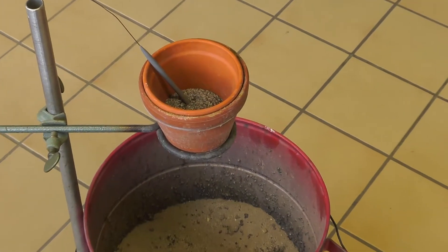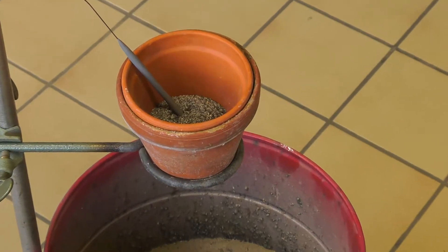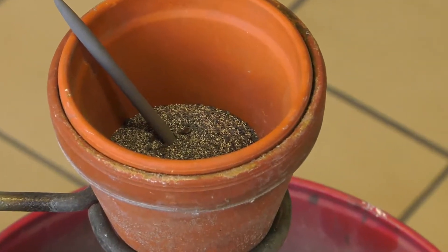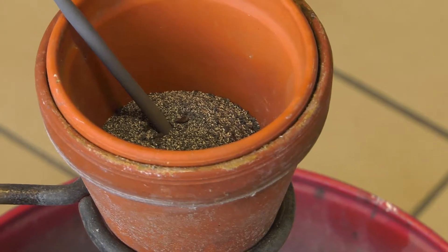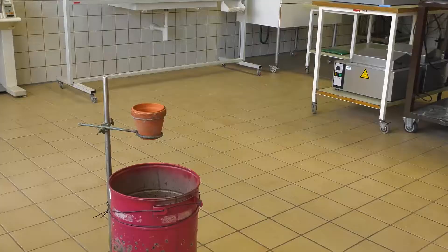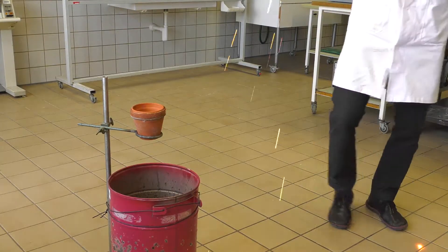At first we put the thermite into a pot which must have a hole on the bottom. Afterwards the pot is converted onto the tripod, which should be placed over a sand bucket or something similar to catch the outflowing hot iron which passes through as soon as the reaction starts.